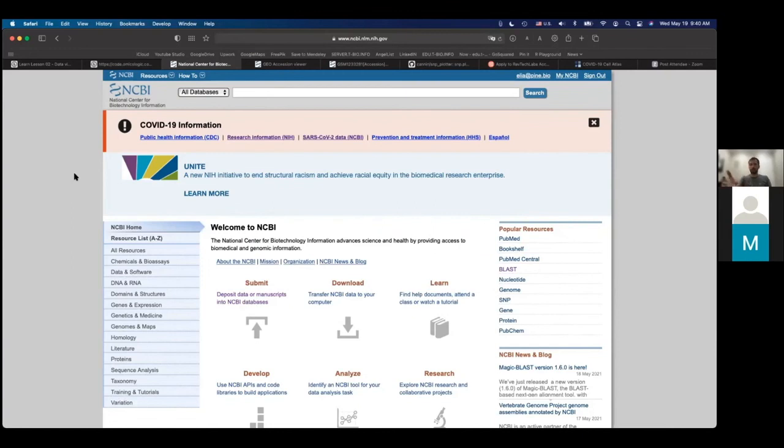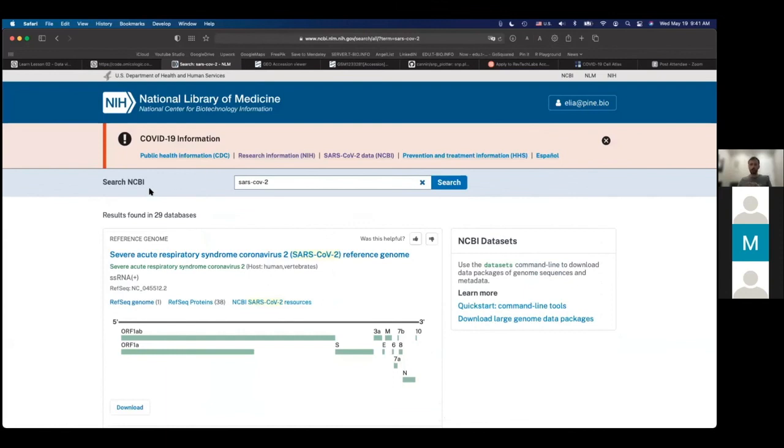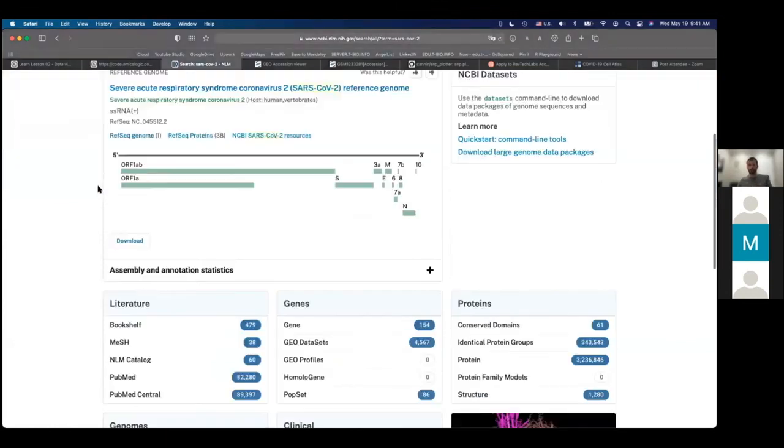Okay, can anyone here provide me with a biomedical topic? Let's think about some biomedical topics. Yes, I will show you how to download some data sets from here, but somebody give me a topic. What are you interested in? Some kind of, let's say, liver cancer, diabetes, okay, SARS-CoV-2, perfect. So let's look for SARS-CoV-2. Obviously there's a lot of different types of information about SARS-CoV-2.